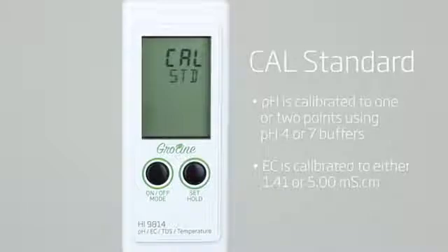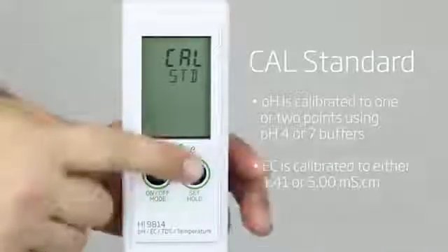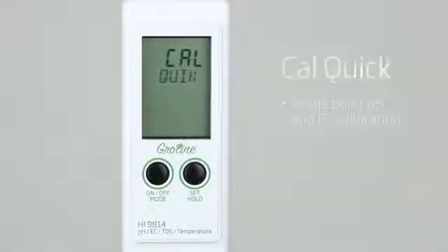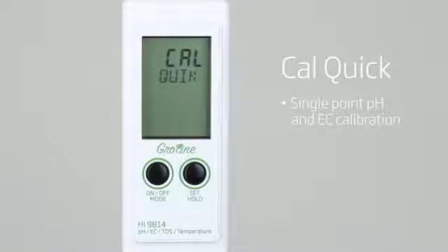Growline offers two types of calibration: Cal standard and Cal quick. Cal quick is used with Hannah's quick calibration solution that is for a single point pH and EC calibration.